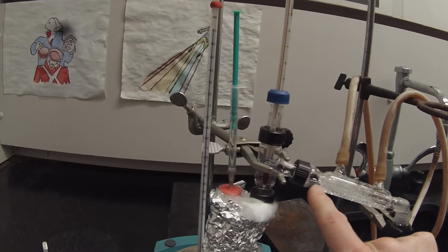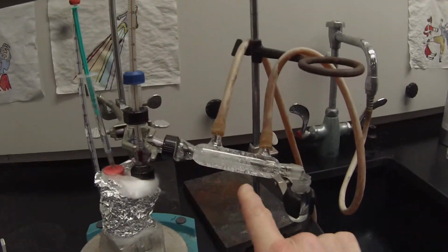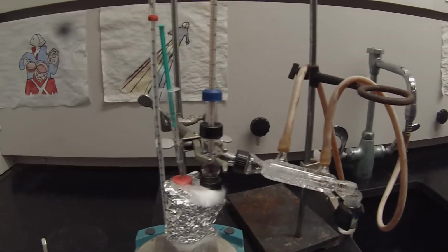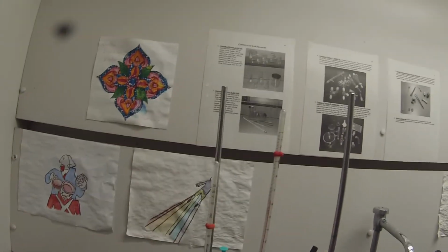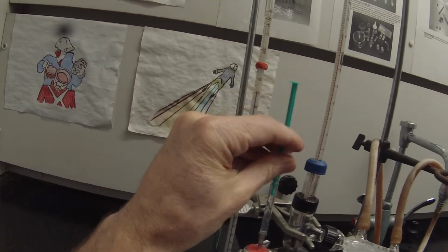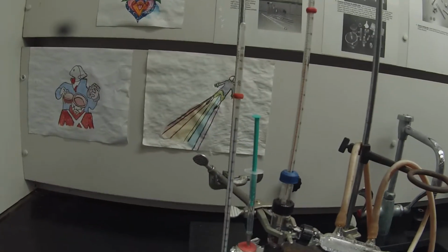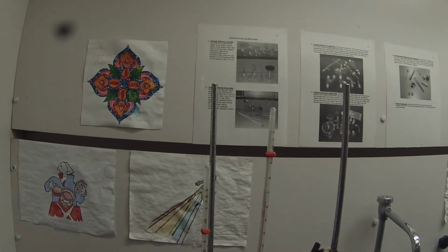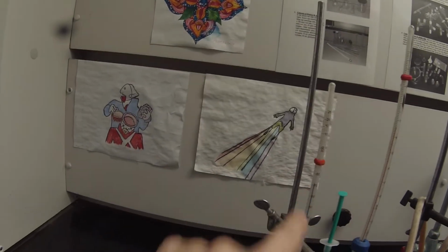I haven't seen anything drip off here yet, but we're definitely dripping off the bottom of the thermometer. A little hard to tell because it's so cloudy with air bubbles in there, but we'll definitely see this fill up. So I'm going to add another half. Take this down to 7, so we've added 3.5 now. And this thermometer is going up. That one's nice and stable at 171.